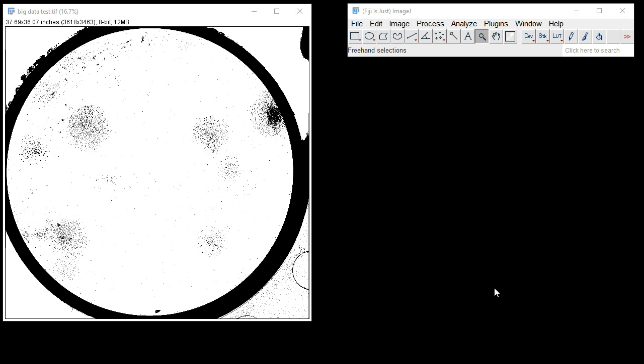Hello, this is a tutorial on the use of the Read and Write Excel plugin for ImageJ/FIJI version 1.1. This version is largely similar in core functionality to previous releases, except it has had extra features added thanks to the work of Brendan Cromhout, whose GitHub repo for this project will be linked in the file description below.